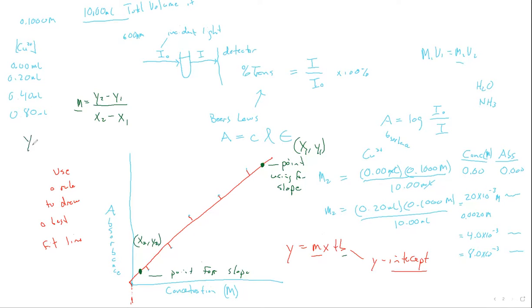You write the letter y equals the number that you calculated here, that would be the number, right? Then you put in x, and then plus the number that you read. And that'll be the equation for your line. This would be the number for the slope, and this would be the number that you read for your B, right? Your B will go right there.